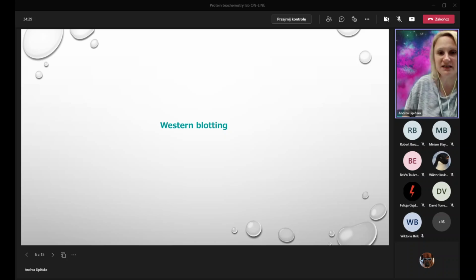Western blotting. So this is something that we will do this week because we are checking the solubility of a protein. And this is usually done when you are doing purification for the first time. If you're not sure whether your protein gets into the soluble fraction, it doesn't make sense to purify it, of course, because you can just waste your resin. Well, many resins are reusable. You can use them many times. But why should you do that if your protein is insoluble? So we check it by Western blotting because we want to be sure which protein is our fusion protein.